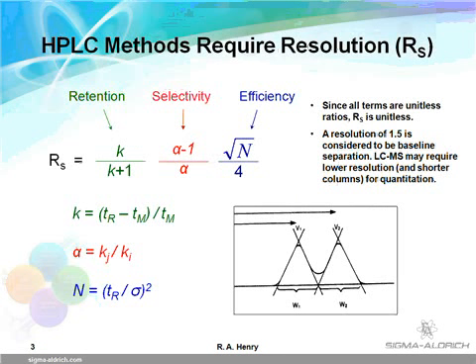In nearly all modes of HPLC, some form of selective retention by the stationary phase is required for column resolution. In order to know whether a compound is retained, one must know the column void volume, Vm or V0, by measuring retention time for a non-retained solute at a given flow rate. Once a column void volume or void time at a given flow rate is known, it will not change. If a solute elutes at or very near the void, resolution caused by stationary phase interaction cannot occur.